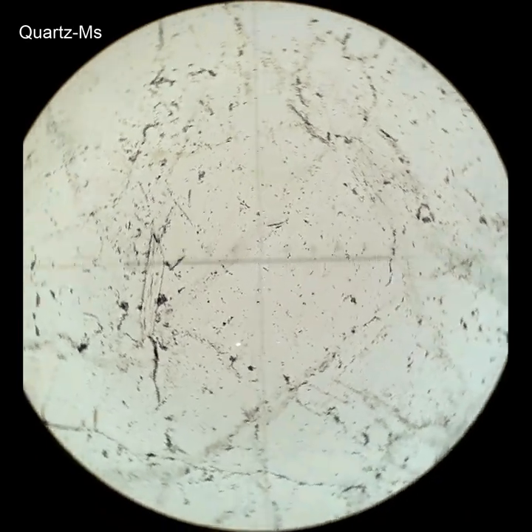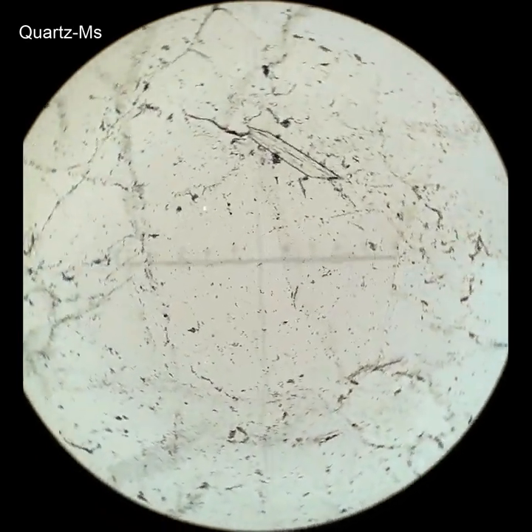Okay, and with this last one, I'm going to show you an interference figure. So here's a quartz grain, obviously centered. And when I cross the polars, you'll see it's almost completely black. Okay, and so that means that the C-axis should be pointing almost perpendicularly out of the thin section.